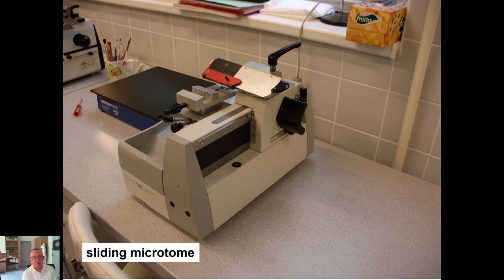Sliding microtome is the most important and most frequently used microtome for paraffin or celloidine sectioning. This is the picture from our lab. This microtome has a blade or knife here.